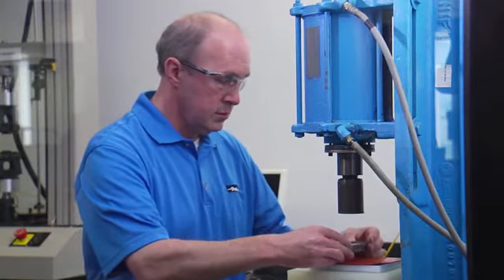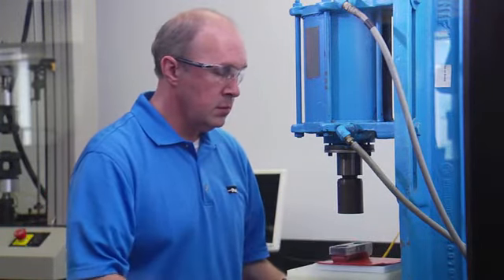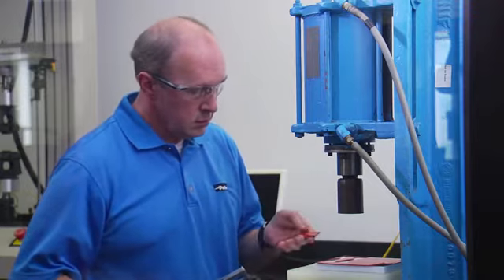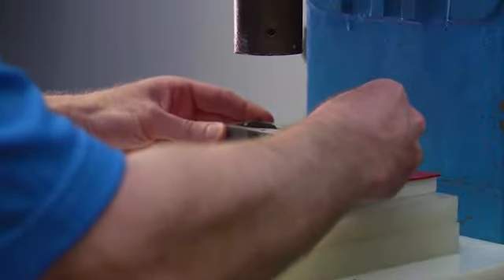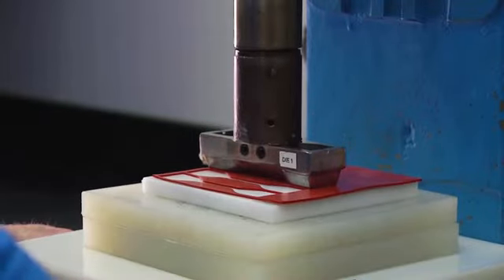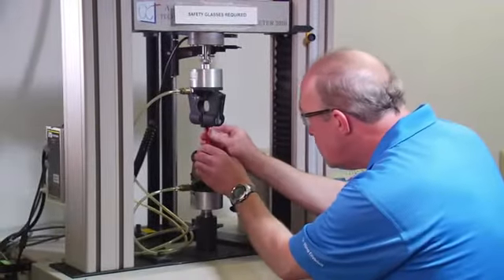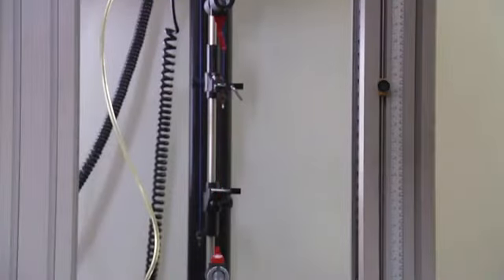Tensile strength, ultimate elongation, and modulus are measured at the same time and can be measured on either O-rings or test platens. Test platens are slabs of rubber 75 thousandths of an inch thick from which an ASTM D412 Die C specimen is cut. The Die C specimen are often referred to as dumbbells or dog bones. Testing of platens requires the ends of the dumbbell to be clamped into the tensometer and pulled at a controlled rate until the specimen breaks.